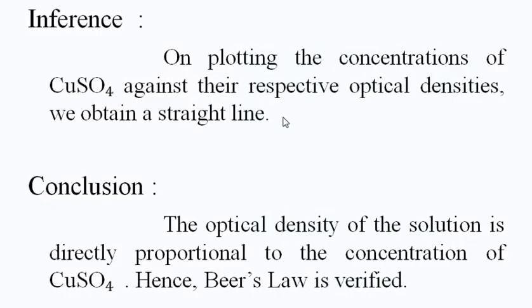So, in the inference, on plotting the concentration of copper sulfate solution against their respective optical density, we get a straight line. And to conclude, since we get a straight line, the optical density of the solution is directly proportional to the concentration of copper sulfate solution, and hence Beer's law is verified.